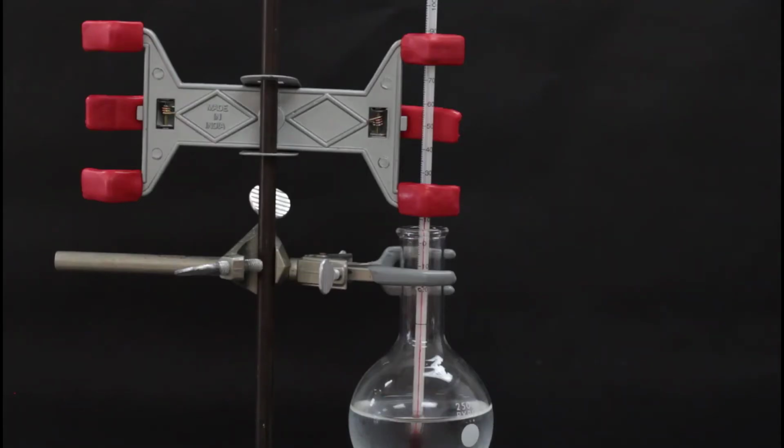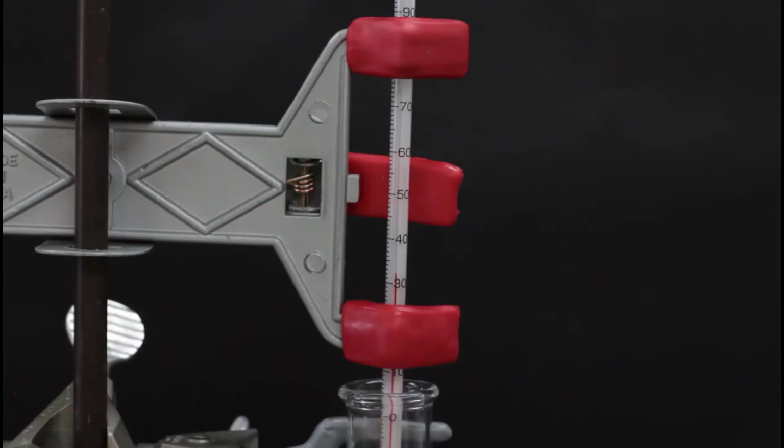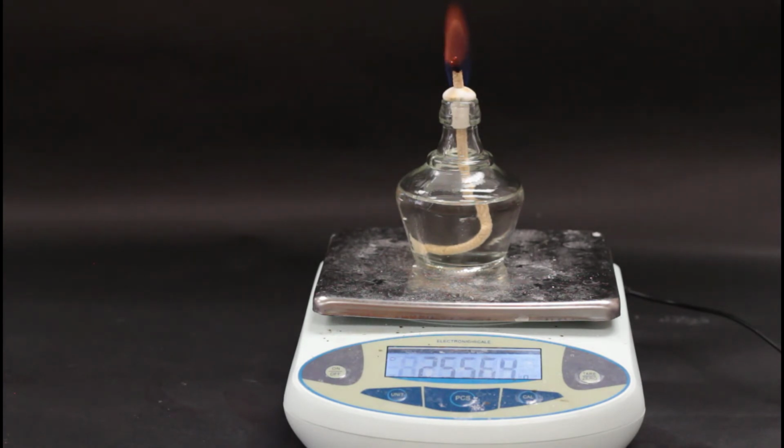Put the thermometer in the clamp so that it is held in the middle of the flask. Record your initial temperature. Light the burner and let the water heat up by at least 20 degrees. Put out the burner and record the final temperature of the water. Weigh the burner and record the final mass. The difference in mass of the burner will be the mass of ethanol that was combusted. Next, I'll show you how to determine the enthalpy of combustion for ethanol from our measured results.